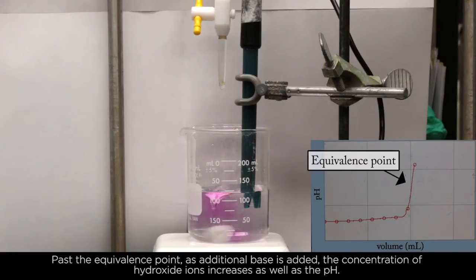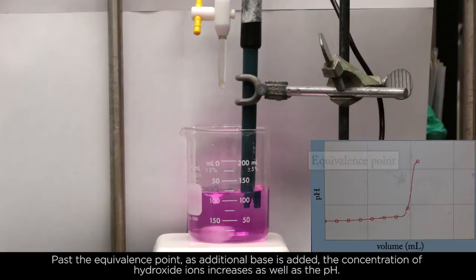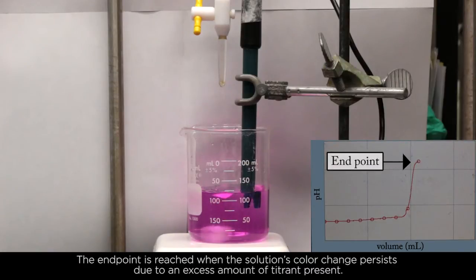Past the equivalence point, as additional base is added, the concentration of hydroxide ions increases as well as the pH. The endpoint is reached when the solution's color change persists due to an excess amount of titrant present.